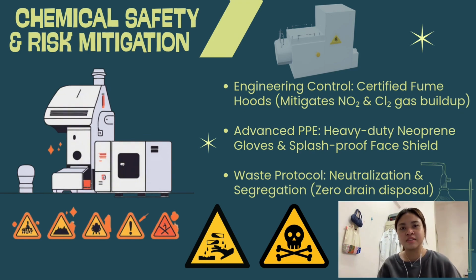Finally, environmental stewardship is critical in analytical chemistry. These solutions can never be poured down the laboratory sinks. They must be carefully cooled, slowly neutralized to a safe pH, and segregated into designated hazardous chemical waste containers.